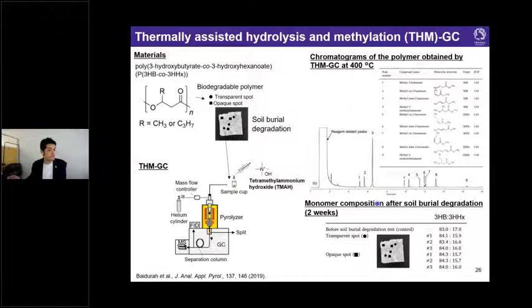But it should be noted that this method is not a suitable way to analyze pyrolysis reaction behavior. Reactive pyrolysis simultaneously conducts the derivatization and polymer pyrolysis in the sample cup. Therefore, the true pyrolysis reaction is limited by coexisting derivatization reactions, preventing mechanistic online pyrolysis studies. Reactive pyrolysis is generally available for the characterization of polymer composition and microstructures.